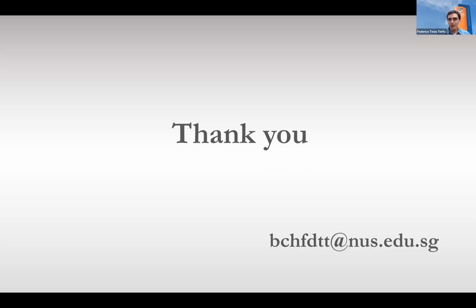Yeah, that's a good question, and maybe you, Maria, are more expert than me in that. We do perform quite a lot of targeted analysis here, and are only now moving more towards untargeted, where DDA and DIA are the preferred methods, right? So I guess it also depends on if you trust your data analysis part of the experiments. DIA is an interesting approach, maybe more robust in proteomics nowadays.